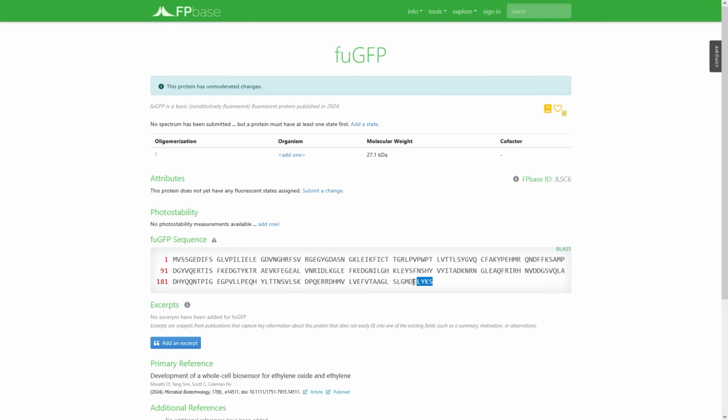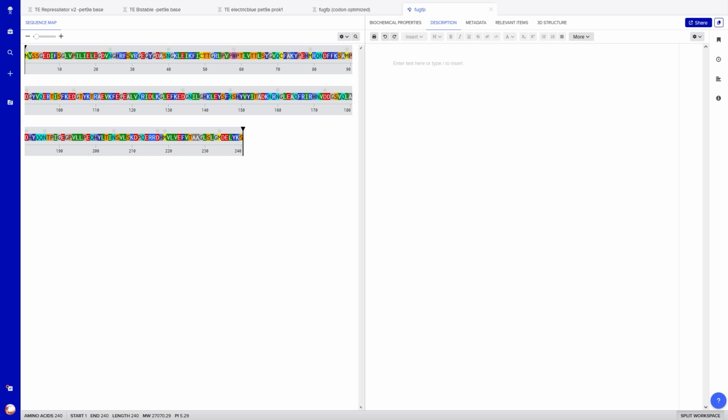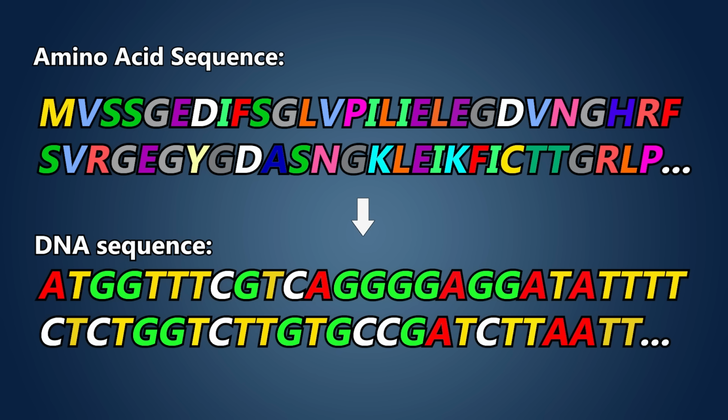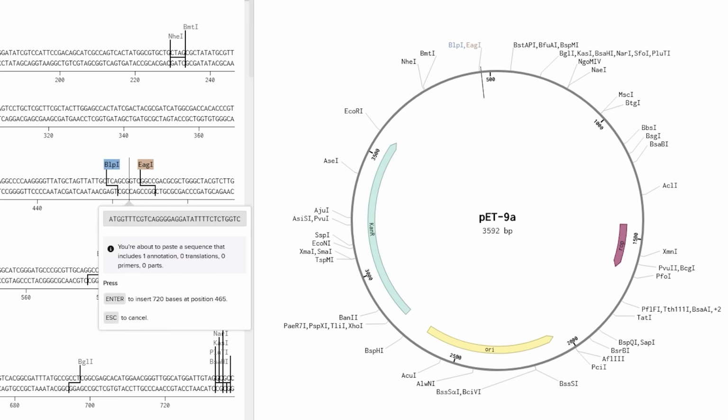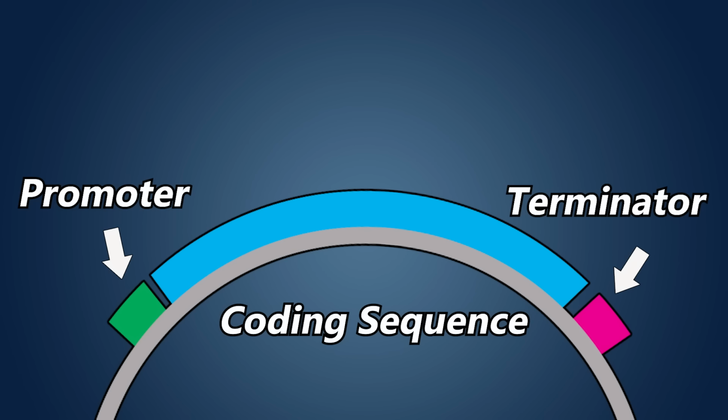However, it's not quite as simple as just copying the sequence you find on this site and pasting it into our plasmid. First, it needs to be translated from protein sequence to DNA, but that'll only give you the code for the protein itself, and pasting it into the plasmid won't have any effect. To make this work, we need two more things: a promoter and a terminator.